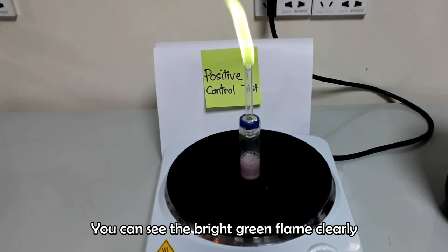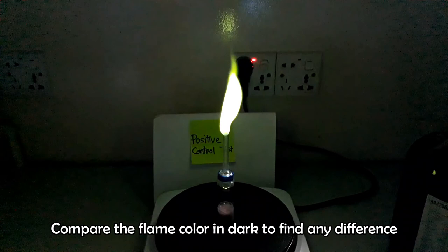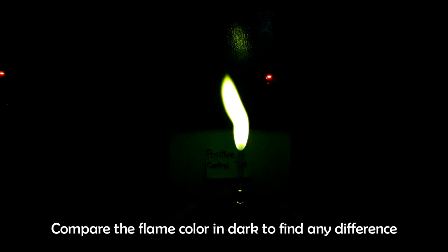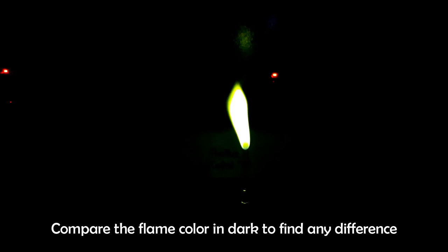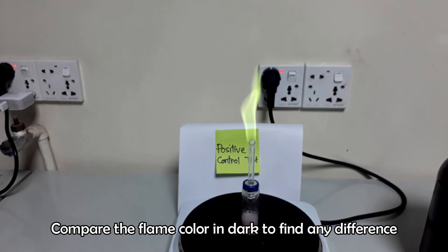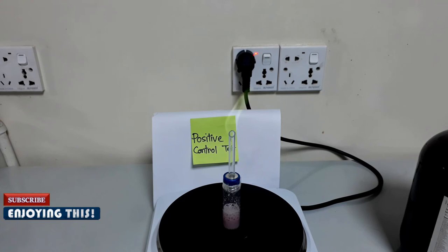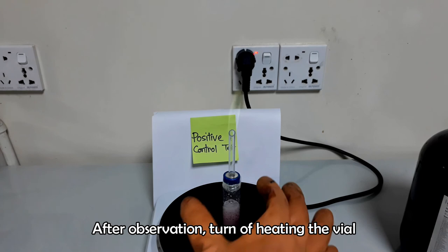You can see the bright green flame clearly. You can compare the flame color in dark also. After observation, turn off heating the vial.